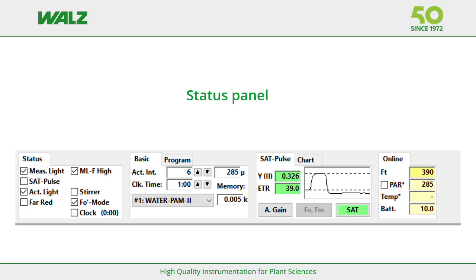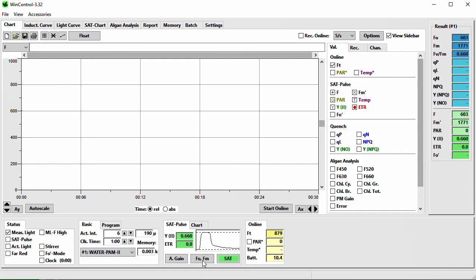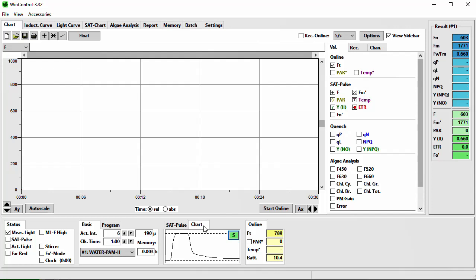The status panel of WaterPump 2 instruments is divided into four fields: Status, Basic Program, Satpulse Chart, and Online. Starting with the Satpulse Chart field — next to the automatic gain button are two buttons, FO/FM and Sat, both of which execute a saturating light flash. FO/FM is used when your sample is in a dark acclimated condition to determine the maximum FV/FM. The Satpulse is used in all other conditions. When the measurement is done the Satpulse Chart will appear. If you want to enlarge the display, switch to the Chart tab of this field — the Satpulse button is still available here to execute the next Satpulse measurement.